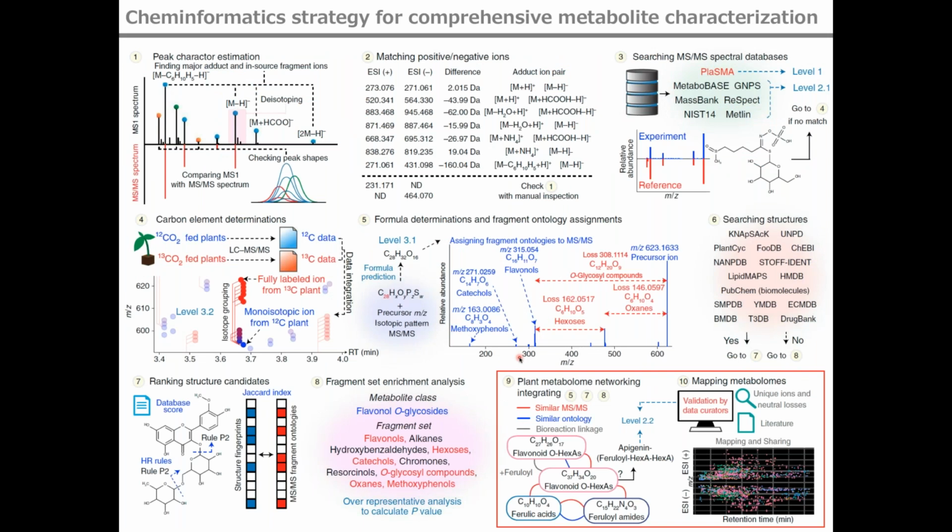And so we also integrated the idea of molecular spectrum networking, as GNPS does, in our study. All metabolite ions are connected in 3 ways, including MS-MS similarity, metabolite ontology similarity, and bioreactivity.